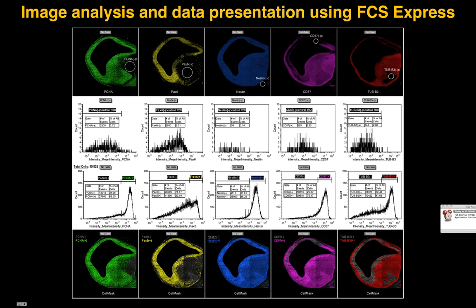And if we were only interested in individual single phenotypes of cells, this may be enough for many applications. However, you can extend this way beyond this, and now you can really have some fun with the data analysis, because just with flow cytometry, once you have identified the positive and the negative gate, you can use Boolean logic in order to identify multiparametric analysis.